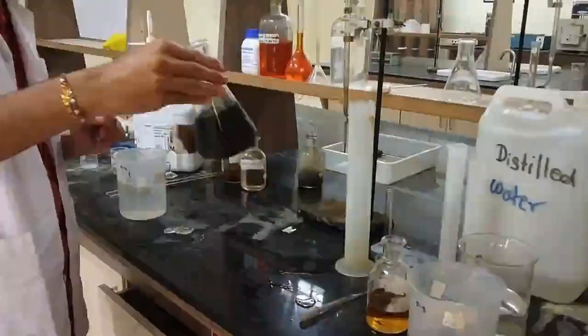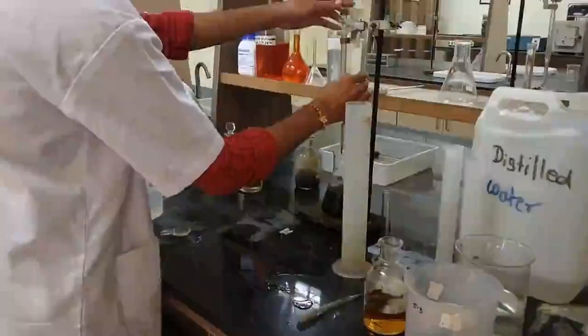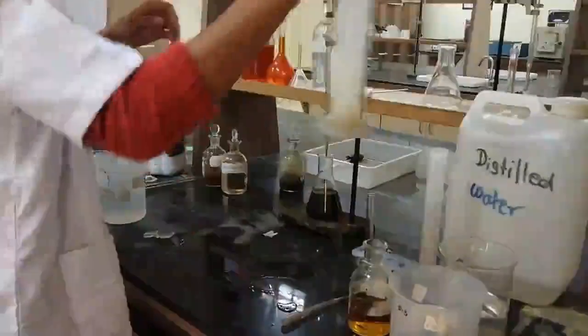Now we are going to titrate this against the sodium thiosulfate that we have prepared, and the end point is colorless. Akshay, can you remove the measuring cylinders?